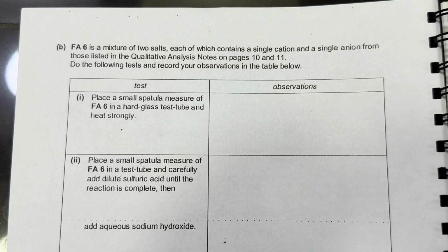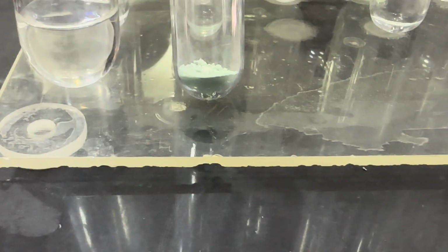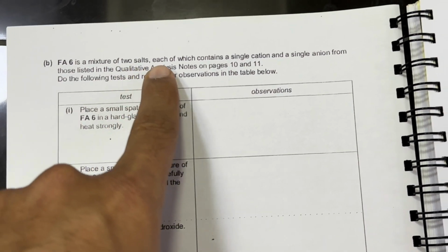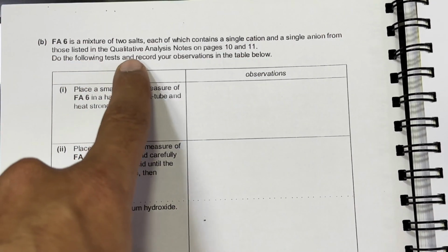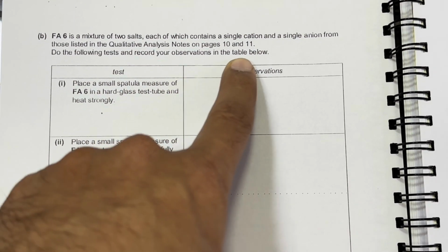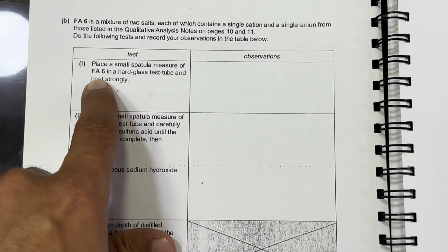Now moving on to the next part of this question, they have said Fa6 is a mixture of 2 salts. Now here is Fa6, and the appearance of Fa6 is green solid. Now they have said it's a mixture of 2 salts. Each contains a single cation and a single anion from those listed in qualitative analysis notes. Do the following test and record your observations in the table below. Now we have to look for the cations and anions. We are starting off with the first test in this page.